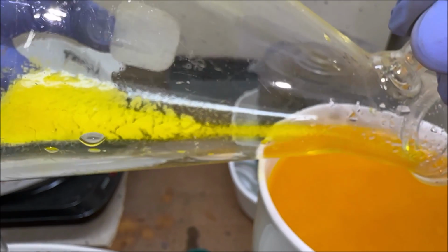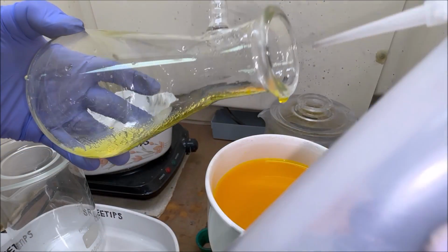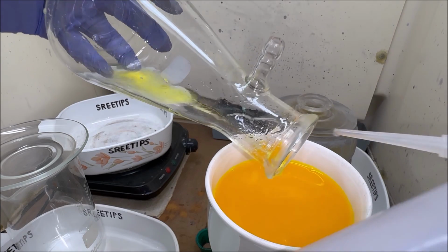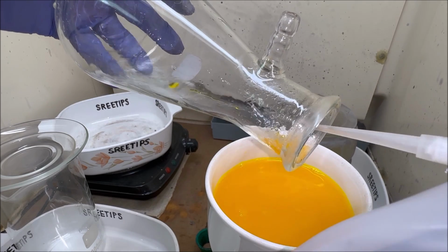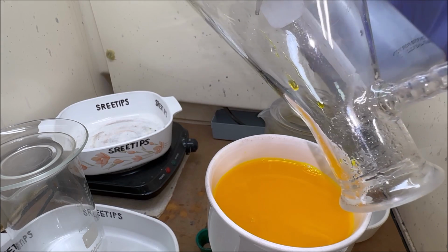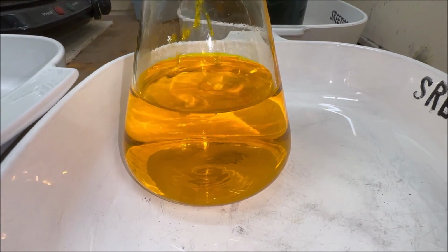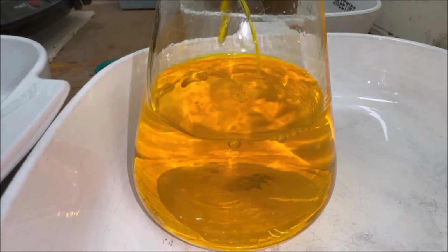See that junk in there? That's our lead sulfate. This stuff is insoluble in water and in acid, so I don't think it's going to hurt anything if we rinse it all down into our filter. Oh yeah, look at our filtrate now. Nice and clear. That's our gold solution.